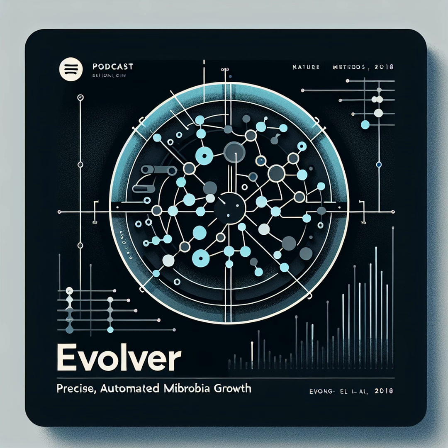What are the broader implications of eVOLVER for the field of autonomous science? eVOLVER represents a significant step forward in autonomous science. It provides unprecedented scalability and control in biological experimentation, enabling researchers to tackle more ambitious projects and ask more complex questions. It's opening the door to more sophisticated experimentation. It's remarkable how this technology is not only enhancing existing research but also creating opportunities for entirely new avenues of scientific exploration. It's definitely a significant contribution to the growing field of autonomous science.